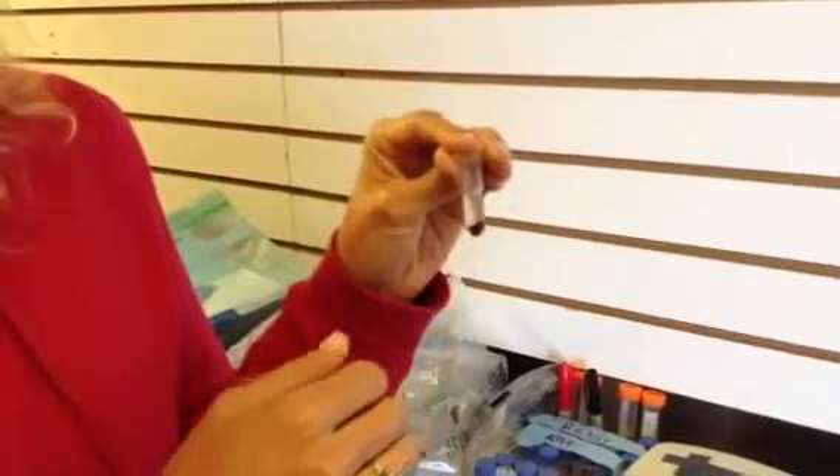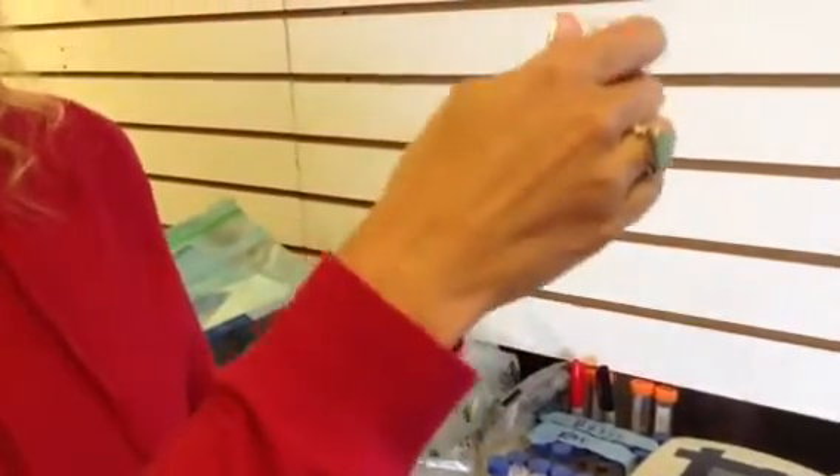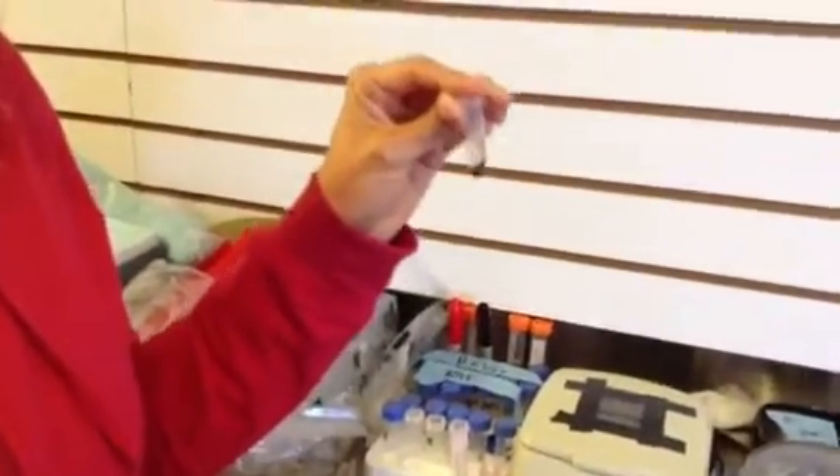The red blood cells will be used later on for genetic analysis. After spinning, I'll be removing the plasma, freezing it in one of these tubes. The plasma will be used for reproductive hormone work as well as further stress physiological investigations.